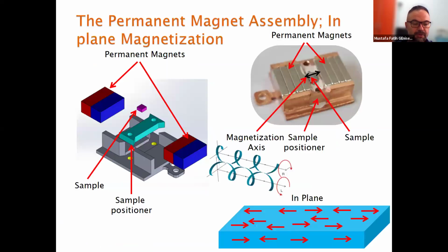So we mentioned the circular polarization of our undulator. Why is it important? It's important for magnetic materials. There is a technique, XMCD, X-ray magnetic circular dichroism. With this technique, scientists can make magnetic moment measurements.